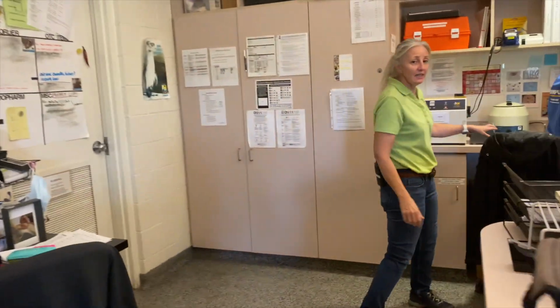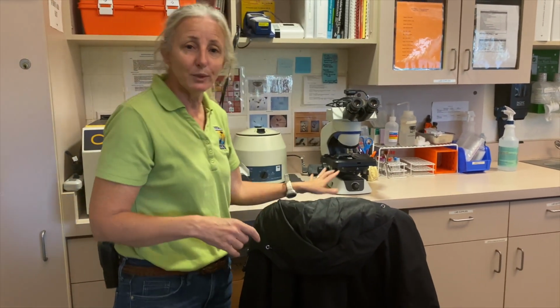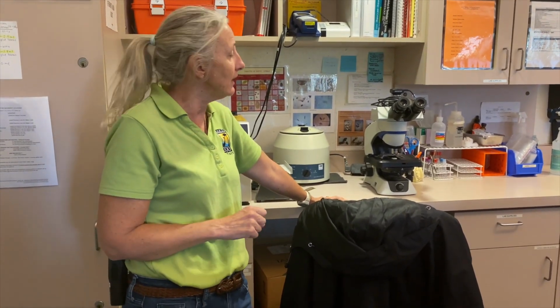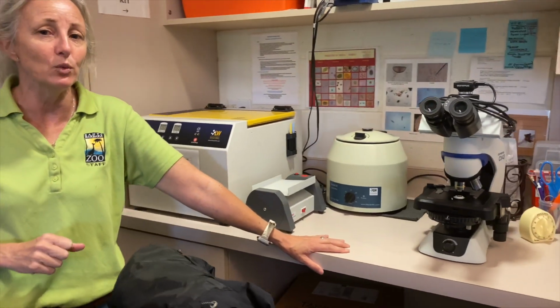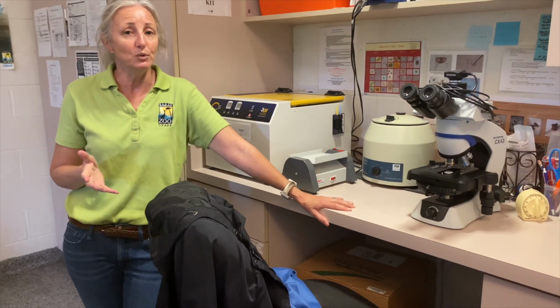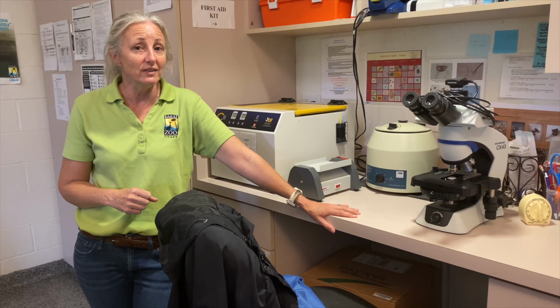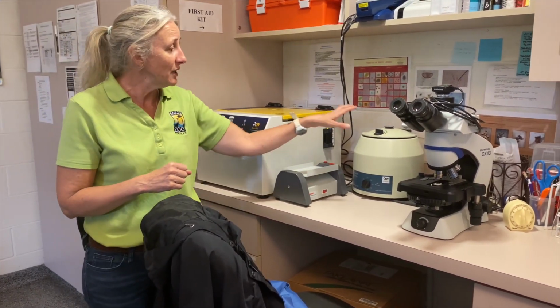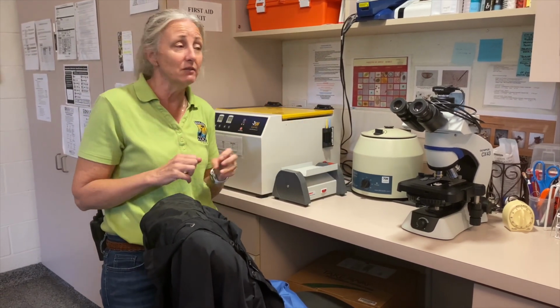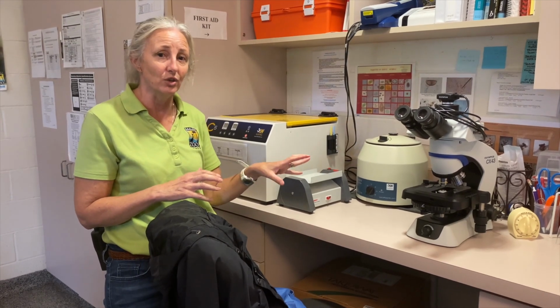So we have equipment here, including a microscope, where we can actually look at samples from an animal. We can look at blood smears, we can look at feces to see if they have any parasites. We can look at all sorts of other samples that we've taken from the animals. So a lot of our samples go out to external laboratories, but sometimes we look at our own samples here as well, and that's very important. And we have the equipment needed to deal with the blood work safely. We have centrifuges and special protective equipment to deal with these samples. Again, a very important diagnostic tool for us.